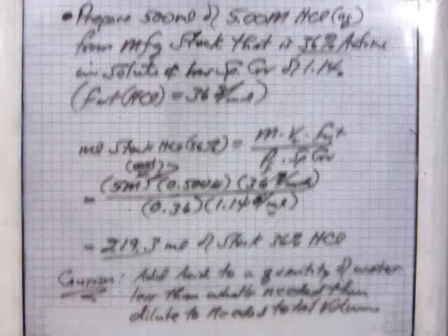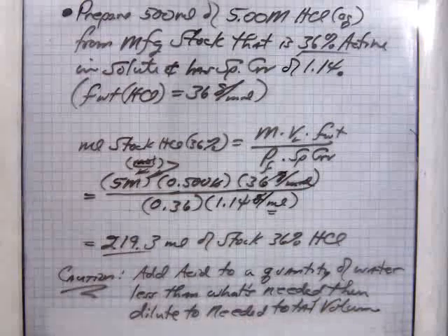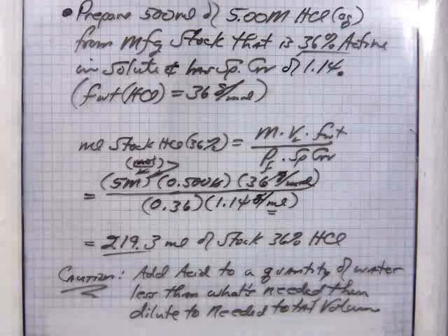Because if you dilute it first in a quantity less than what's totally needed and then finish with diluting to the mark, as is frequently referred, then you will avoid that danger of flash is what will happen.